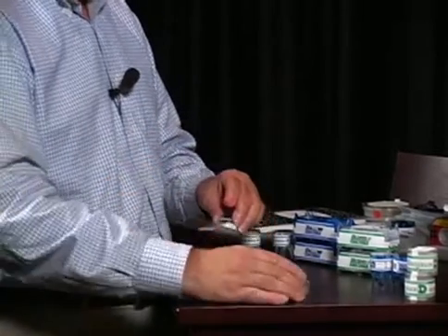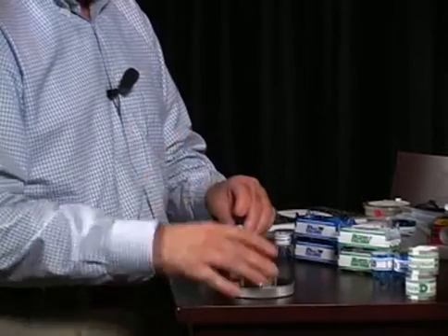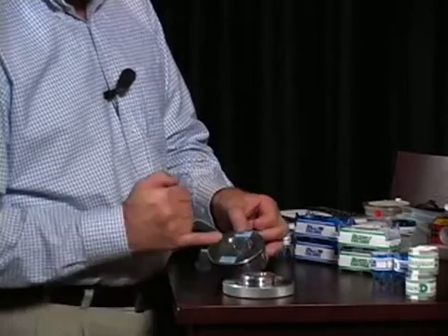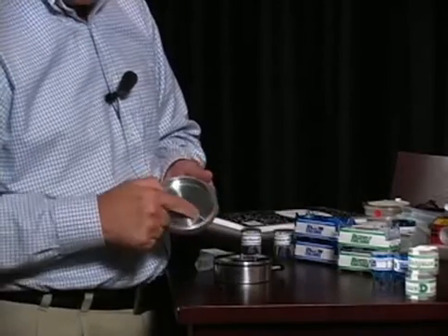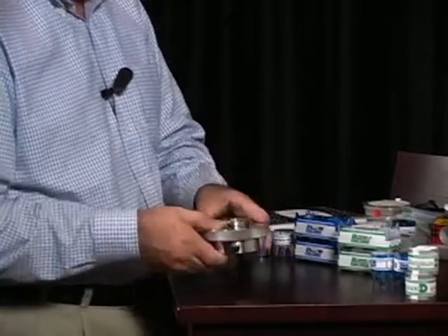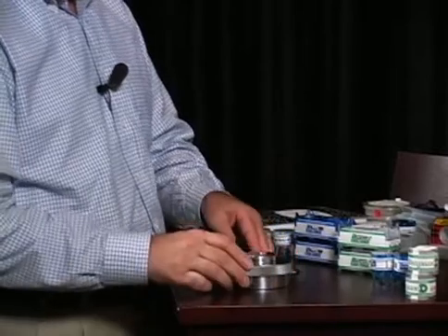We often get samples like this where they don't check it, they're upside down, and it's very frustrating for the client because they have to repeat the sample and it costs money. There's a little guide that you put it in there so it fits perfectly in the middle. This also has a guide. Two posts go to these two posts, and they clamp together. You hook it to your pump. You draw it for the appropriate time, 15 and 10, much like the Cyclex D. And when it's done, merely remove it, take it out.